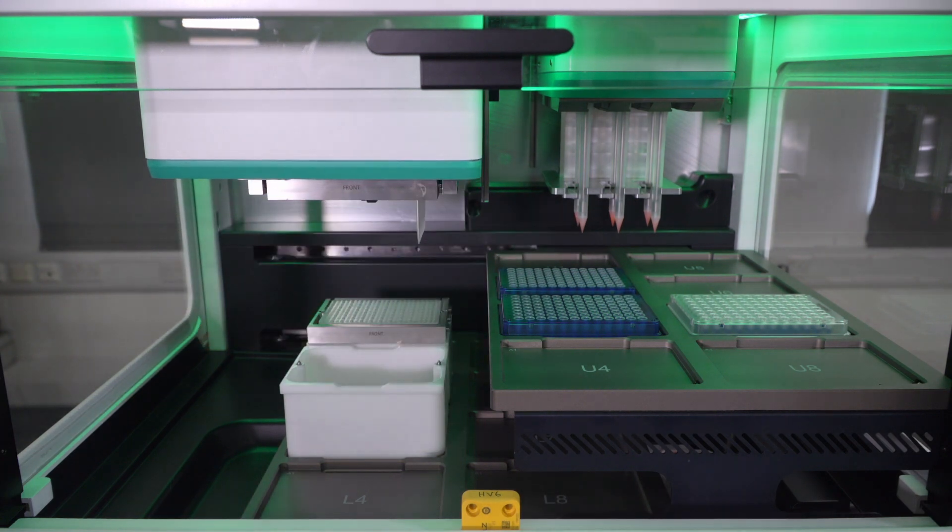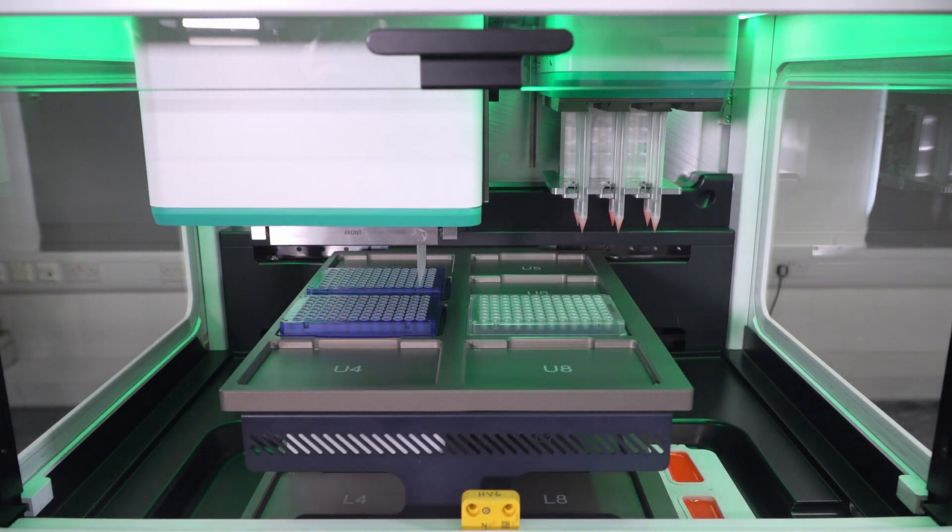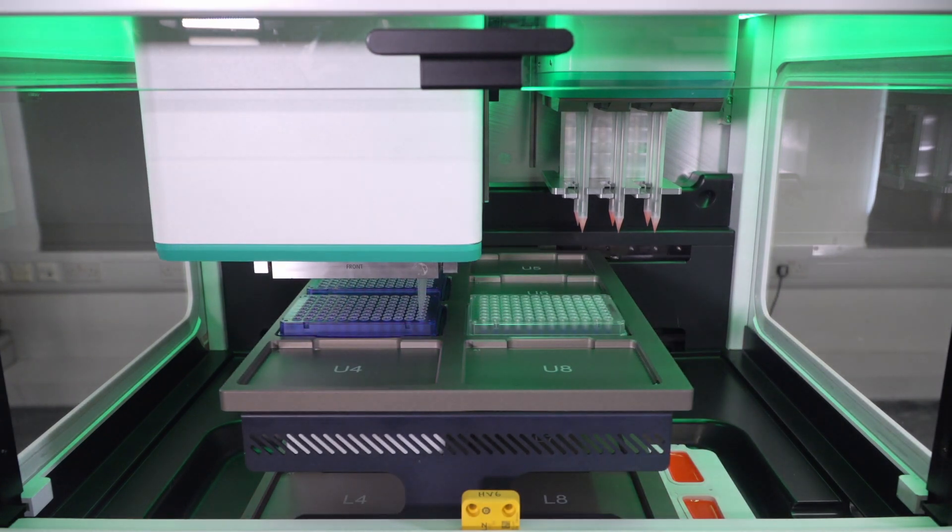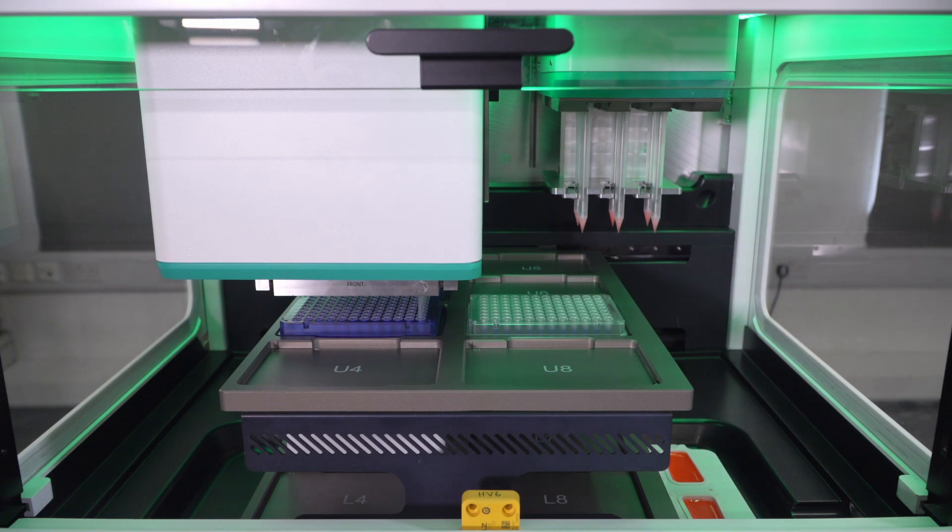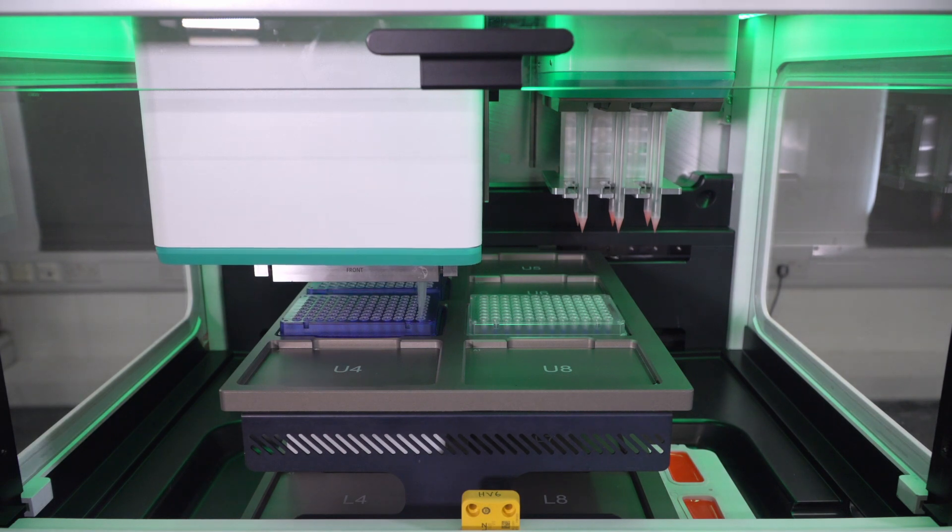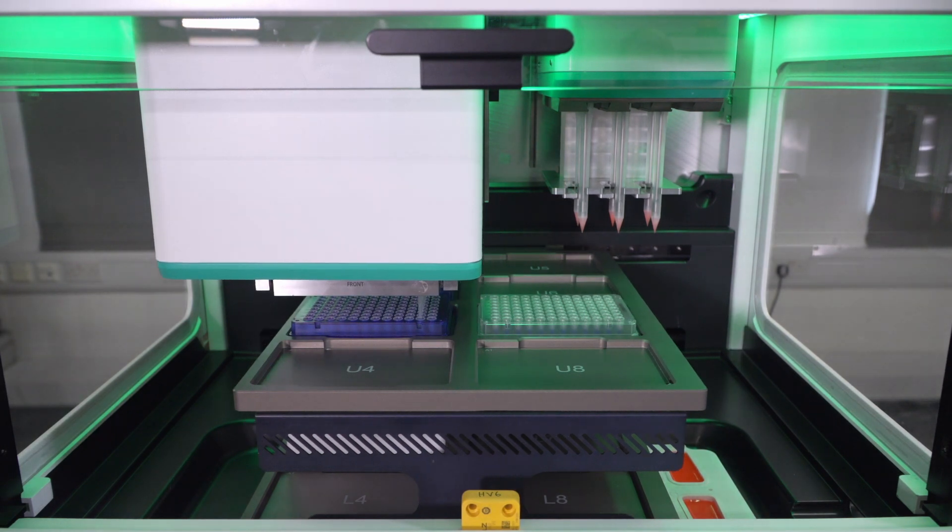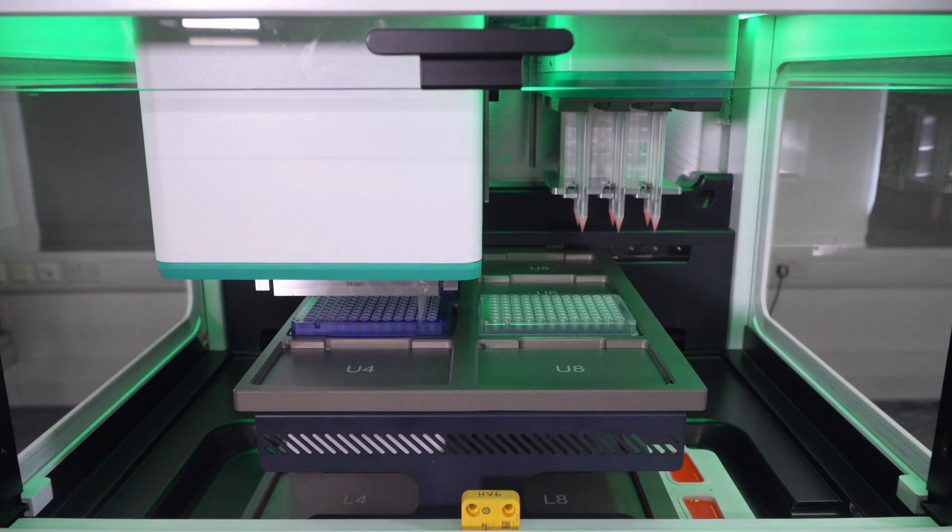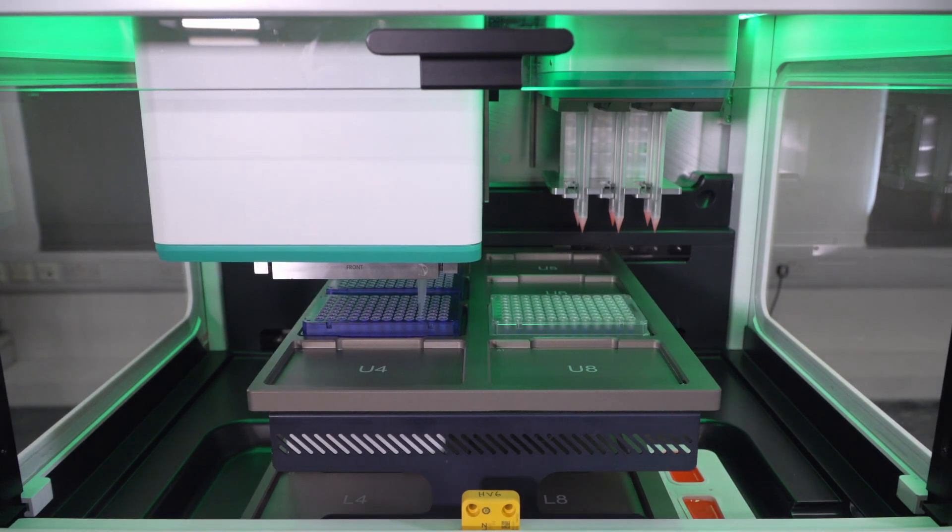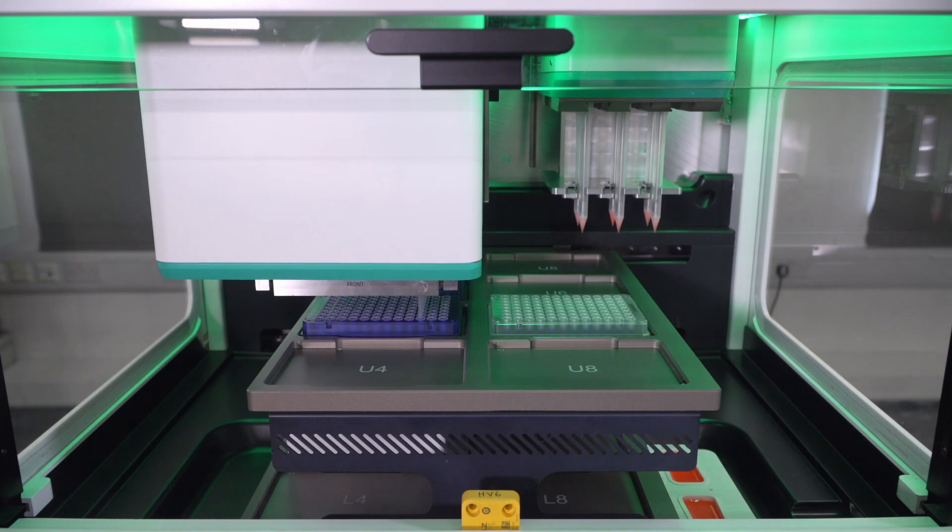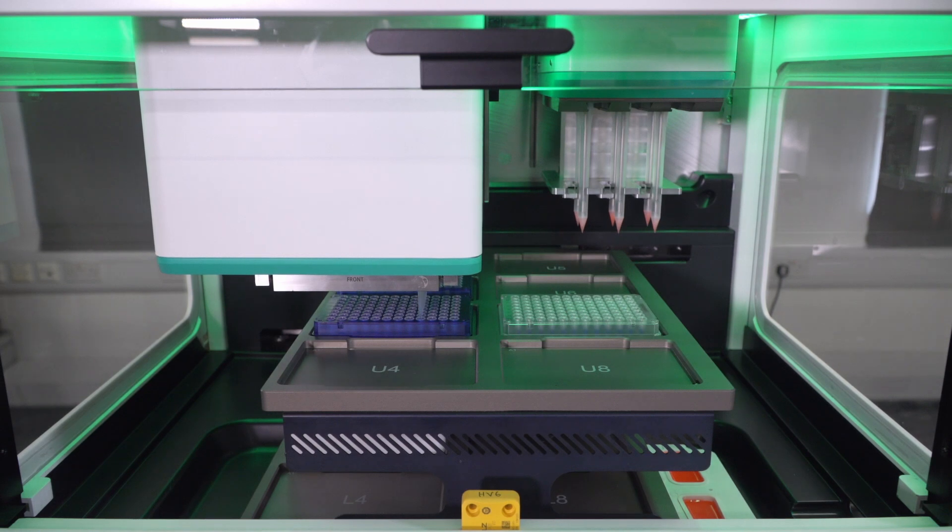Next, the strip is moving into our intermediate plate. And starting from column 12, it's going to aspirate the liquid from column 12, and then move into column 11. Again, aspirate liquid from there, move into column 10, and so on. It will move across the whole plate in order to pool all the samples.